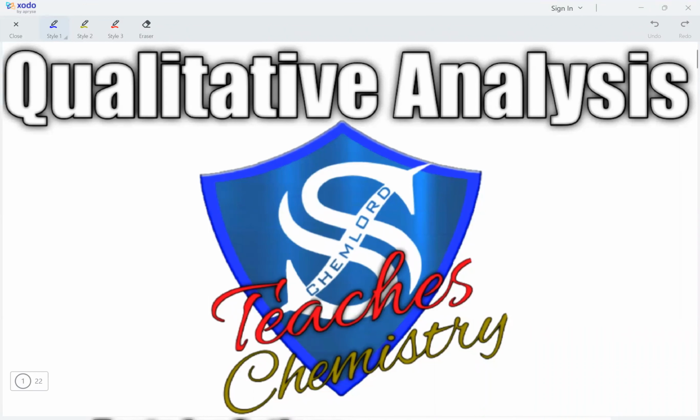Hi guys, in this video we will be looking at the qualitative analysis test for gases. Now we have different gases that we can test for, and these include ammonia, carbon dioxide, chlorine, hydrogen, oxygen and sulfur dioxide.